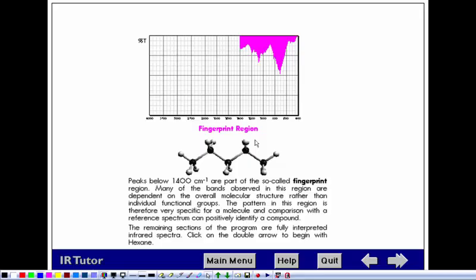Well, it has some lead in it, but nothing to be concerned about. The 1-inch gap at the midfield, it's huge, and all the black tarry stuff, I'd be more concerned about that than the actual field itself. But that's how they use it for fibers. You'll hear, oh, well, this person was wearing a nylon shirt made by whoever. Well, that's because they're comparing the infrared of the fibers. So that's where it's used a lot more.